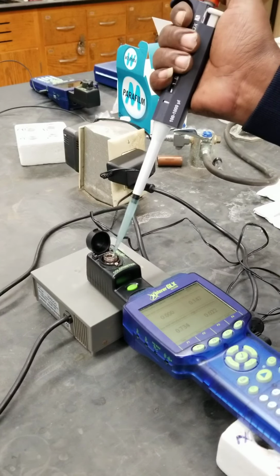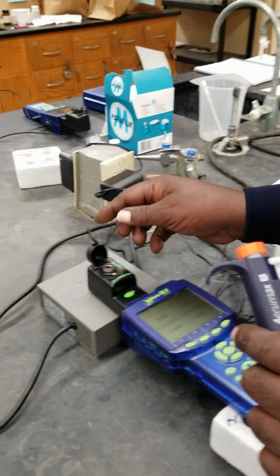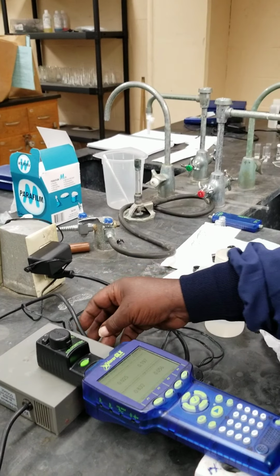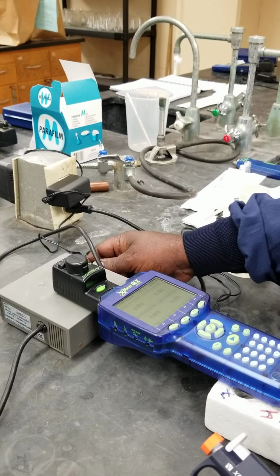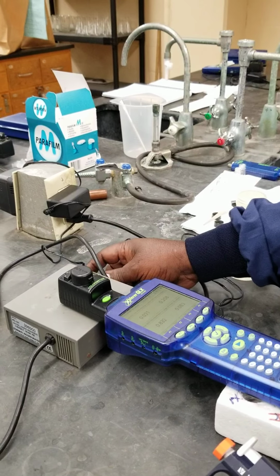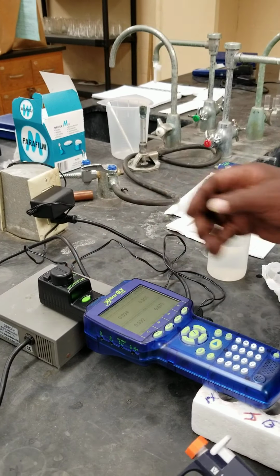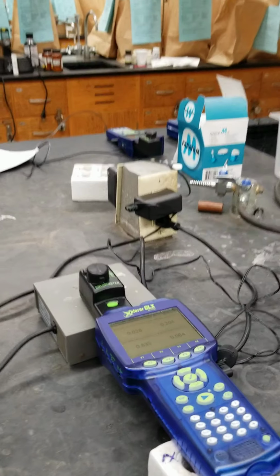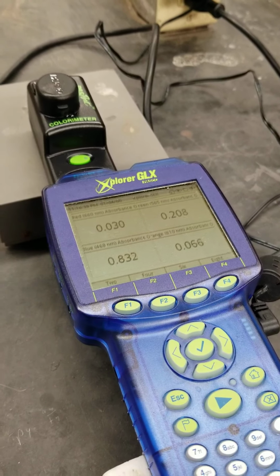So the seventh addition. Is it sixth or seventh? Sixth. Yep. Some people can't count. This is number 6, my friends. The previous one was 5. So the absorbance value is 0.832.